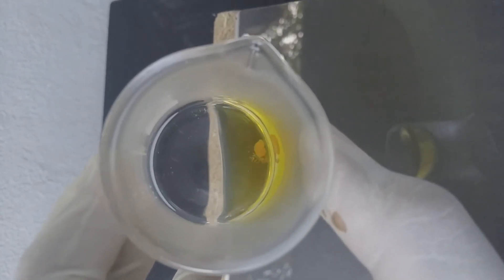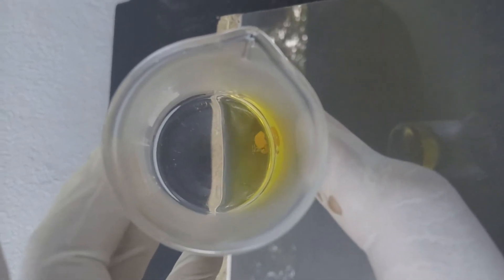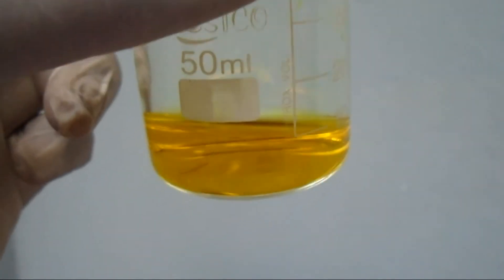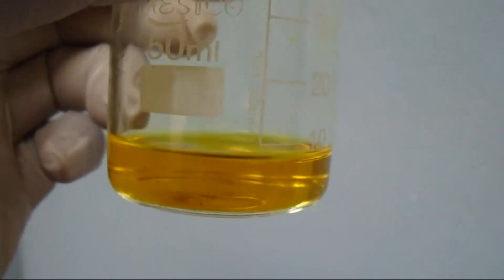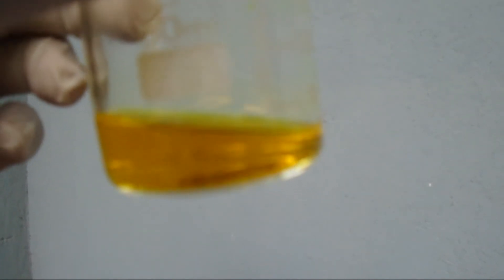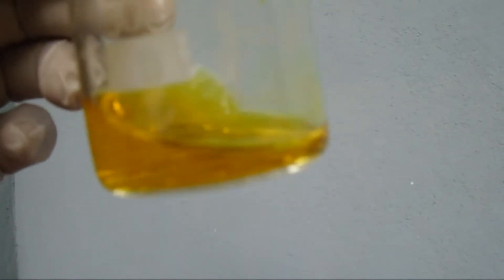Now I am going to heat it a little bit and we will see what happens. After the reaction, you can see a very clear solution — a nice yellowish gold color solution.